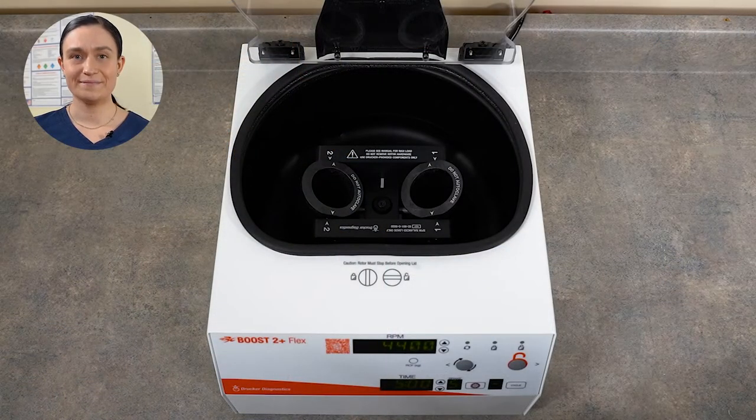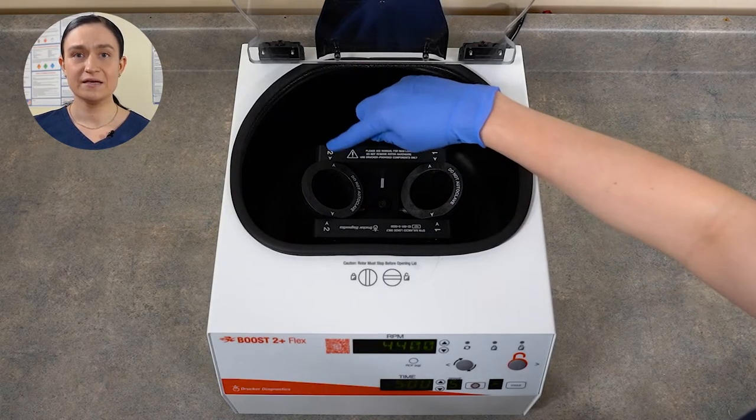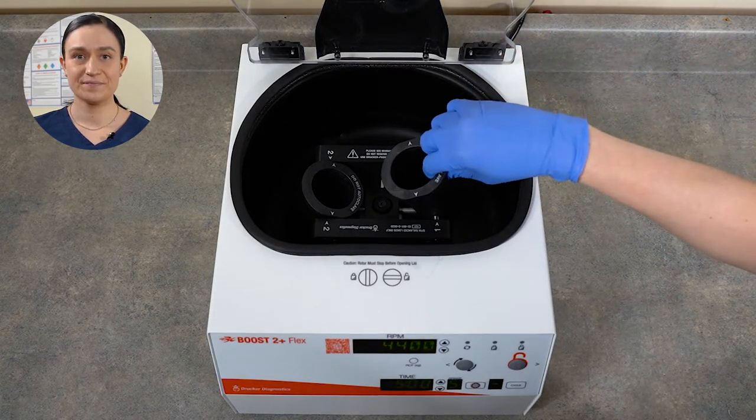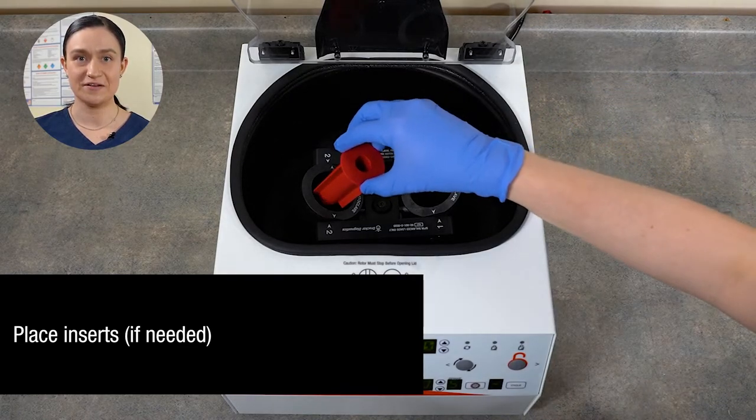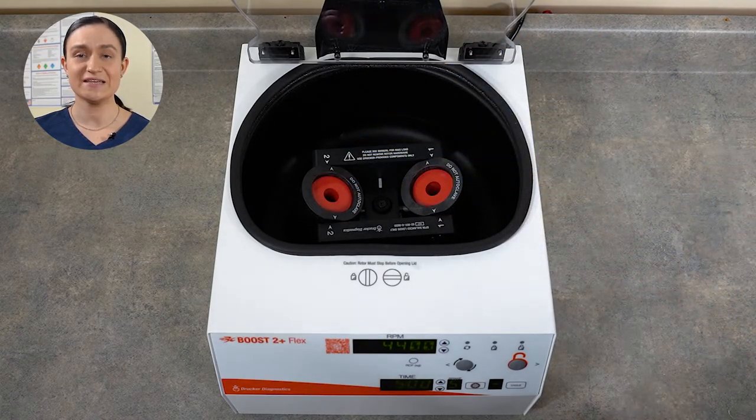Now let's look at how to load your Boost 2 Plus Flex and spin your first samples. Part 3: Spinning Samples. Before we can spin a cycle, we need to make sure the centrifuge is correctly loaded — that means the samples it will spin are balanced. Like any centrifuge, the Boost 2 Plus Flex should always be run with a balanced load. This helps keep the lab safe and ensures maximum lifespan for your centrifuge. Step 1: Make sure that both buckets are loaded. These buckets do not snap or click, but rather rest on the pins inside the centrifuge rotor. Step 2: Place inserts if needed to spin a smaller tube. If using inserts, they must match — the insert in one bucket must be the same dimensions as the insert in the second bucket.